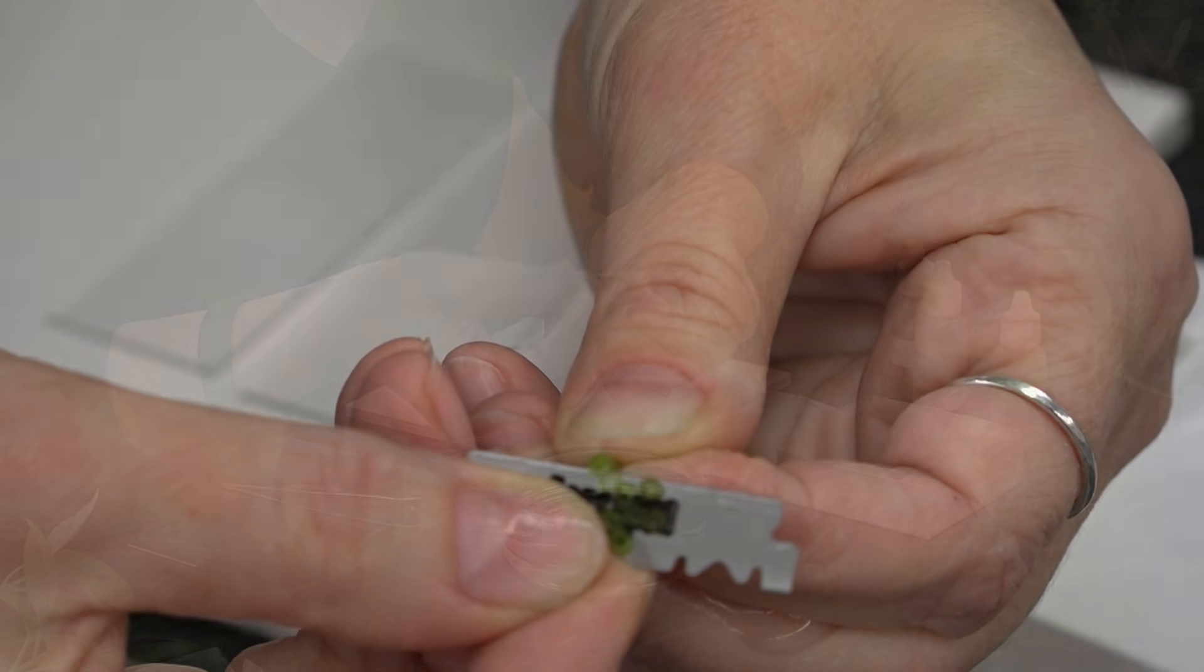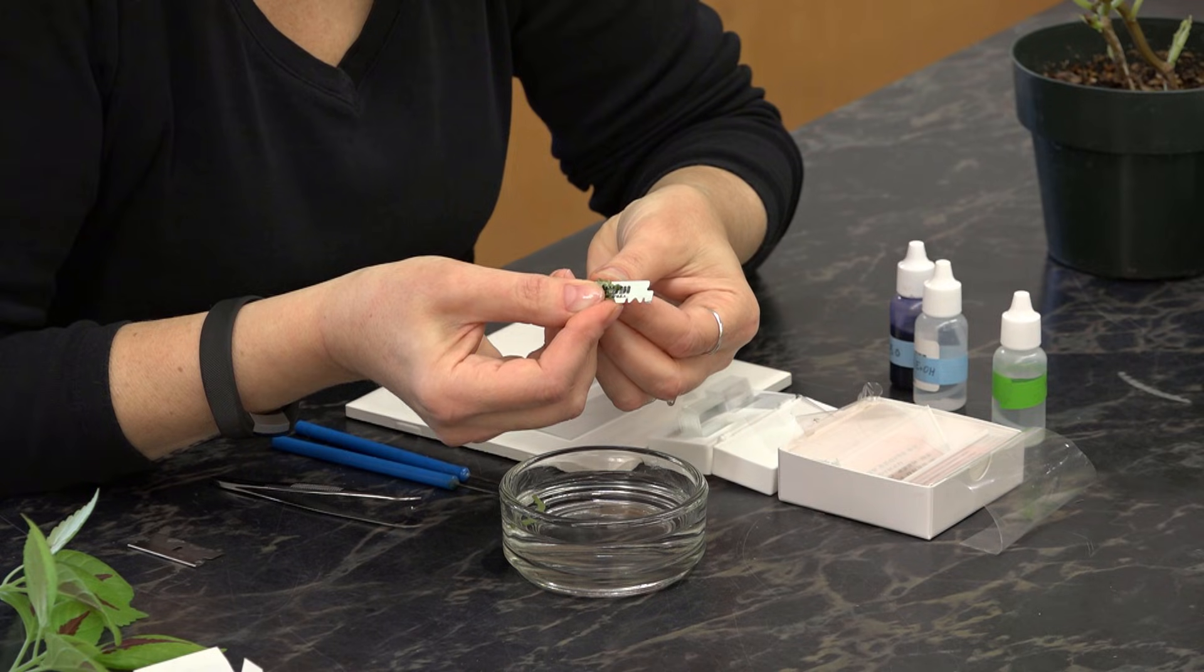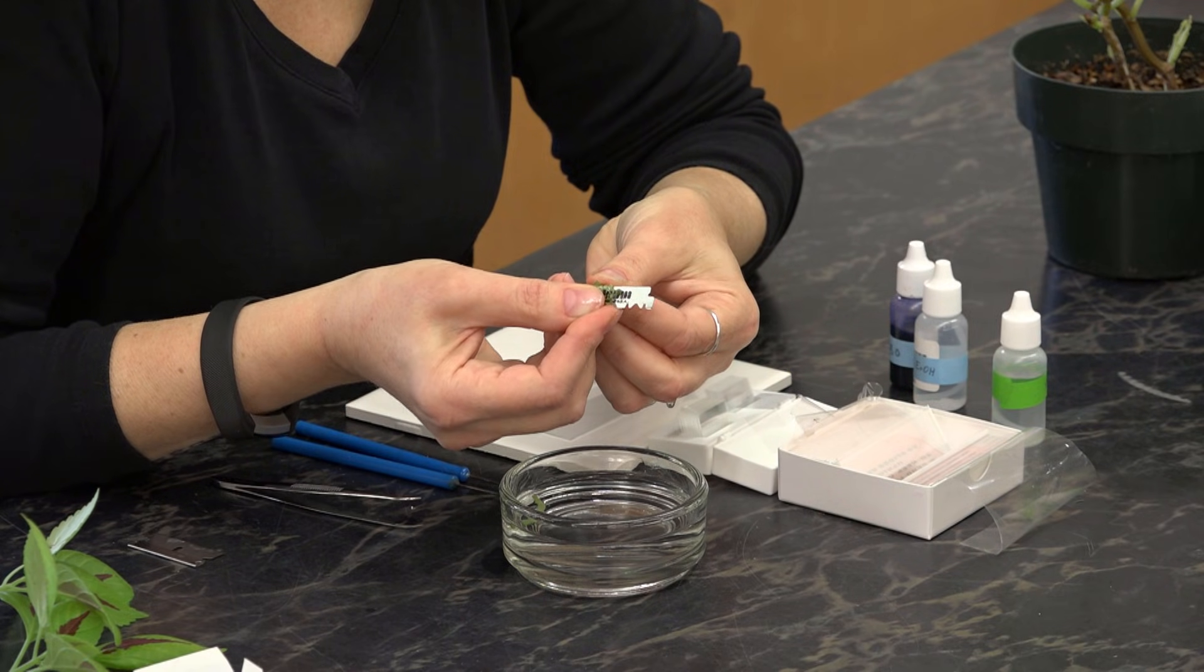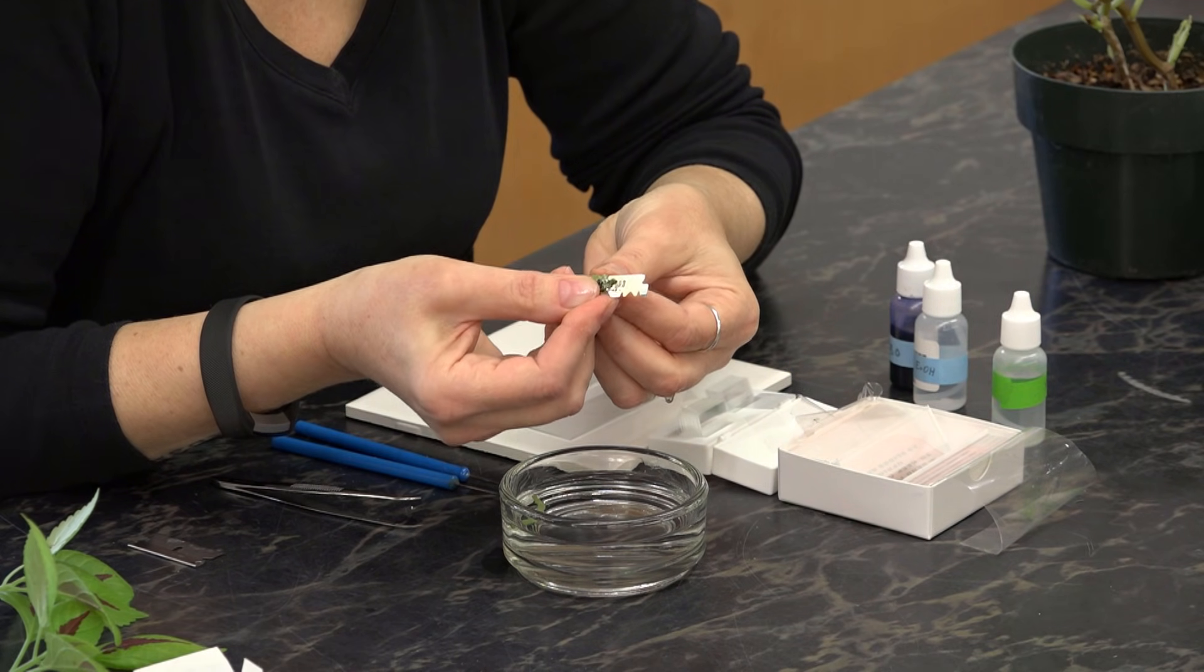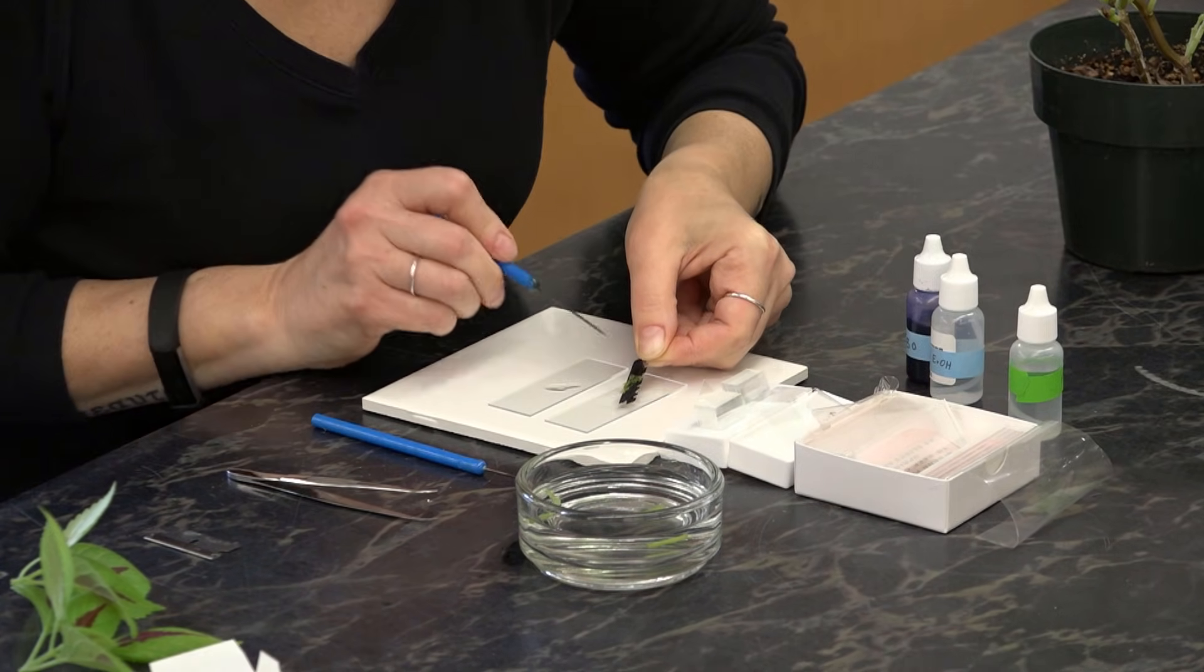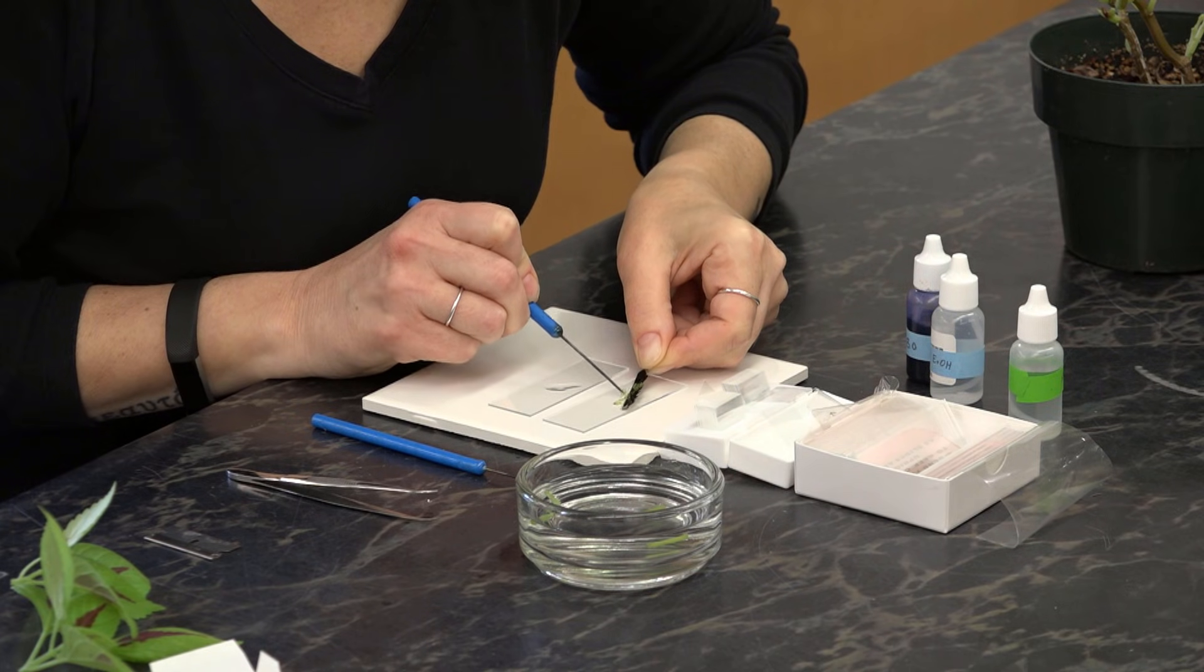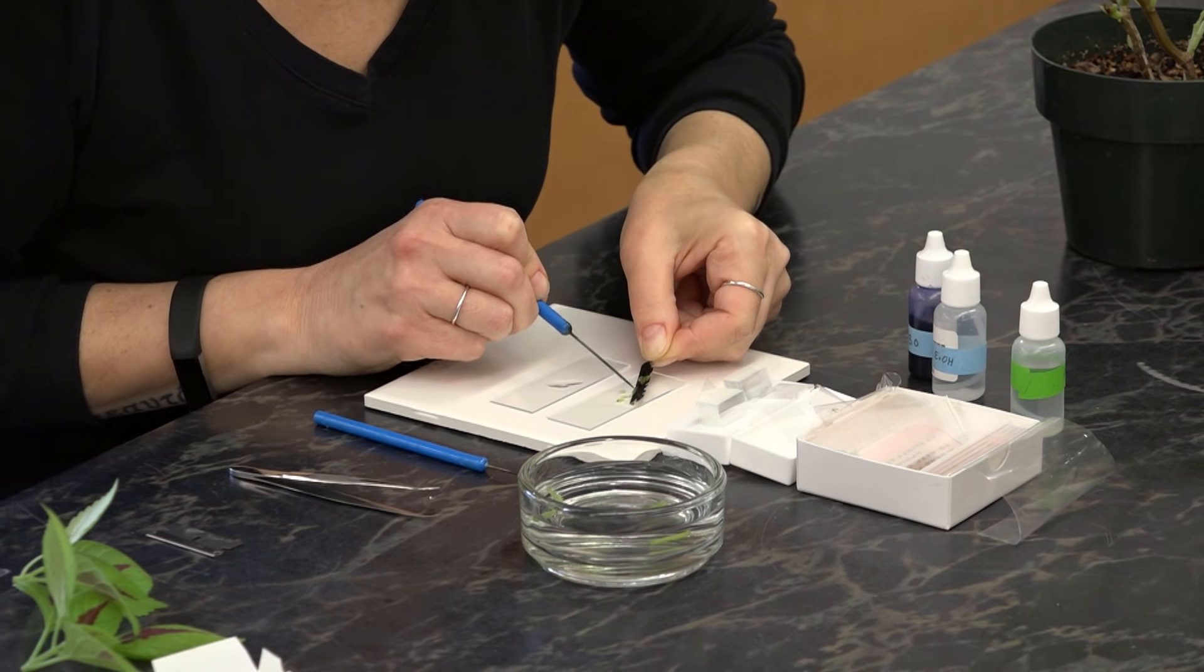As you're drawing it through, let them accumulate along the edge of the blade until you feel that you have quite a few sections there. Now take your dissecting needle and transfer your sections onto your slide.